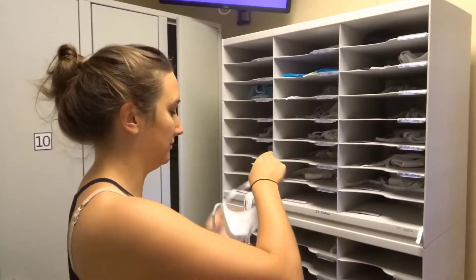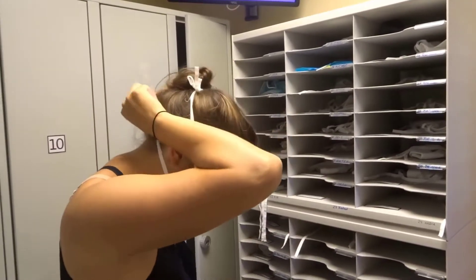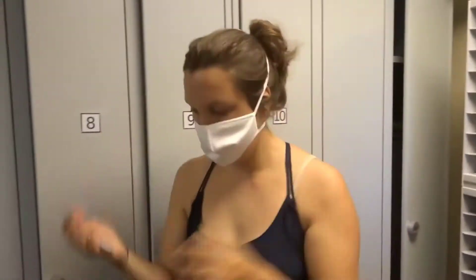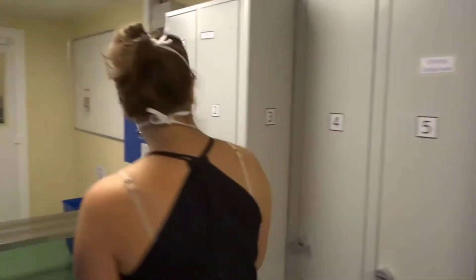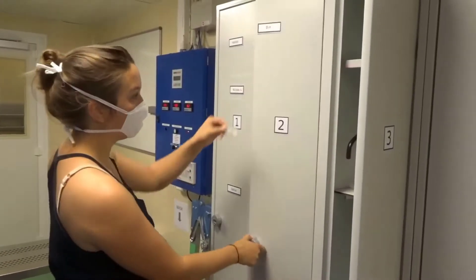You will also find in your rack a magnet label with your name on it. You can now find a free locker and put your name on it so you can own it for the week.